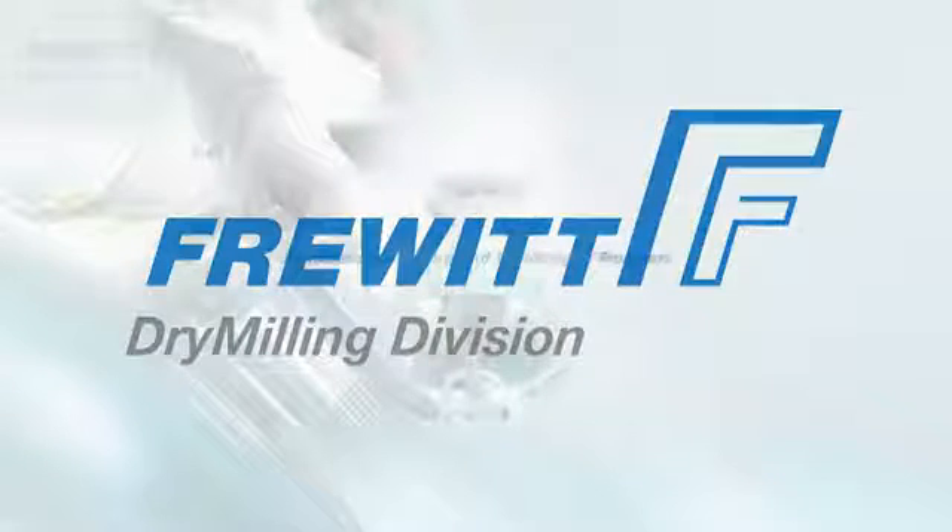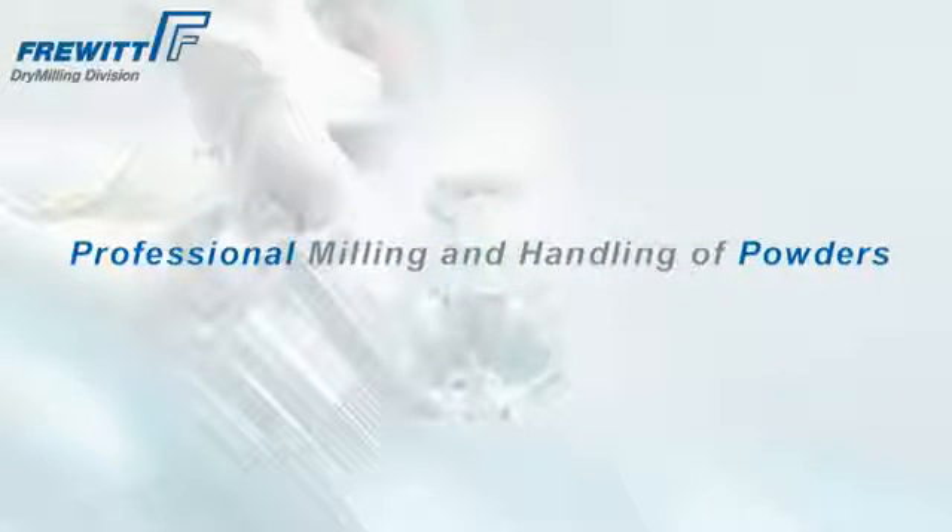Frewitt Dry Milling — your global partner for milling and sizing processes in the pharmaceutical, food, and fine chemical industry.